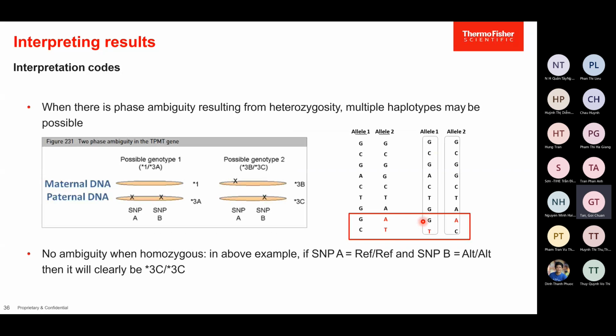This is related to the concept of microarray. Microarray is a platform for you to genotype, right? So at the end of the day, what they give you is all these different SNP locations, and what is the nucleotide or alleles that is present.